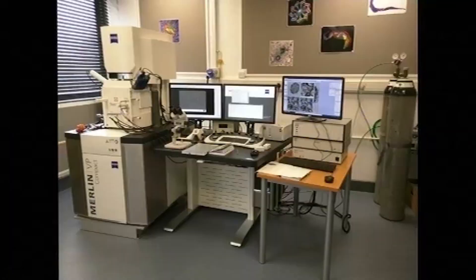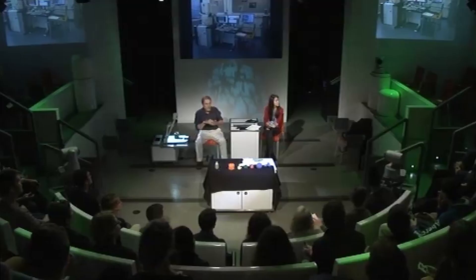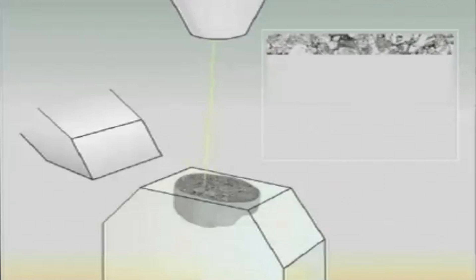This is our latest scanning electron microscope. It's quite a big beast. It can be used for taking those nice 3D pictures, but that's a bit of a waste of its capabilities. What we've got inside the chamber here is a cutting machine, a microtome, like a bread slicer. So we can take specimens and cut them and look down into them.